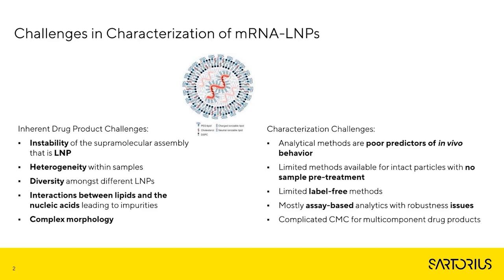Now, in characterization, there are these challenges. Because of all those reasons, the analytical methods currently available are poor predictors of in vivo and in vitro behavior. That generally means that what we are looking at is not really the most important part, or at least it's not the whole part.